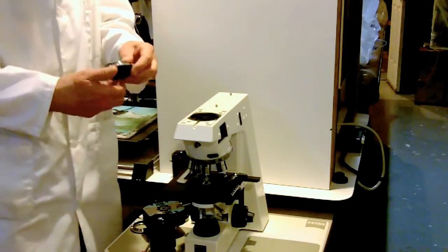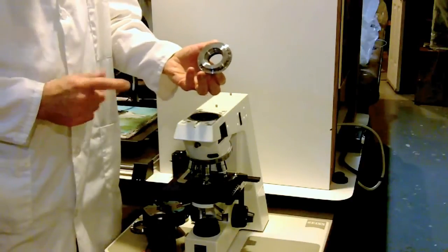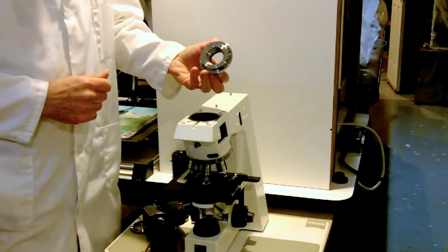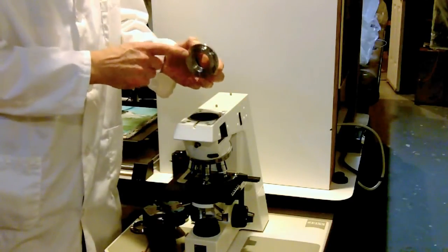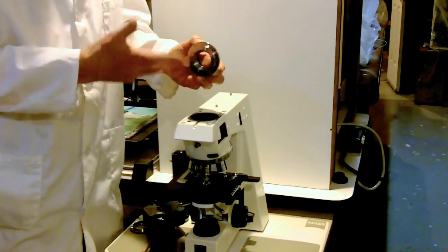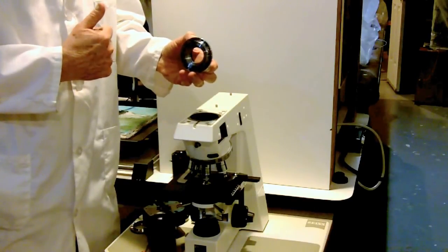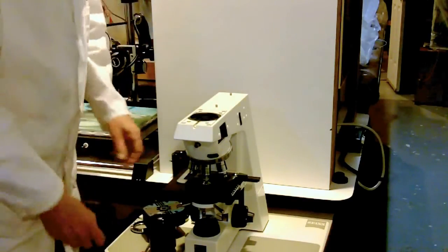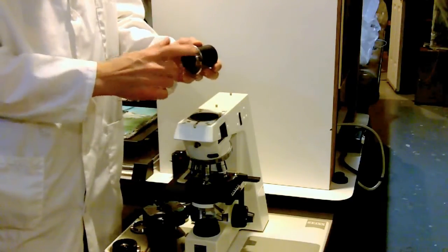And to do that attachment, we simply use an adapter that comes with the component when ordered for the microscope in question. So there are bayonet adapters like this one for the Zeiss, the Nikon, the Olympus, and the Leica infinity corrected microscopes.